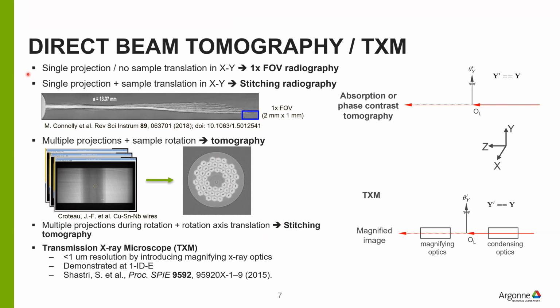These measurements right now and in the future will be limited to about a micron of spatial resolution. If you want to go sub-micron into the nanometers range, Sarvjit, Peter, and Bob Suter at Carnegie Mellon have demonstrated that in the high energy regime, transmission X-ray microscope is possible. This TXM technique will get us to sub-micron resolution.